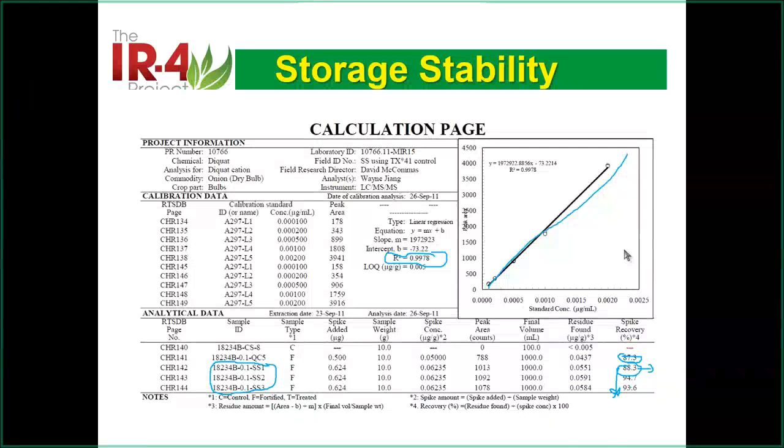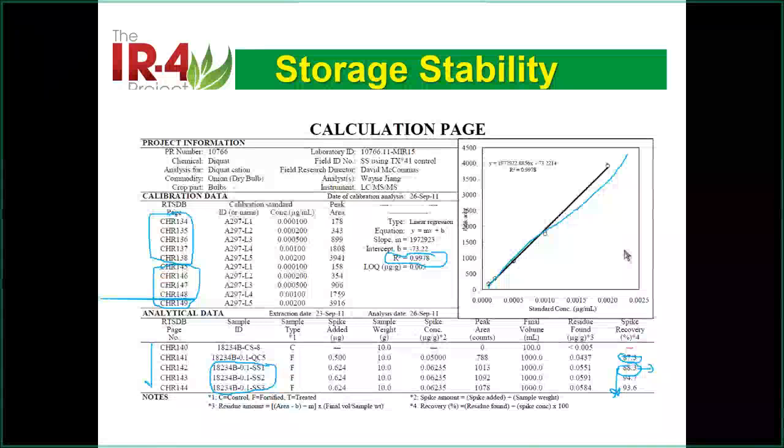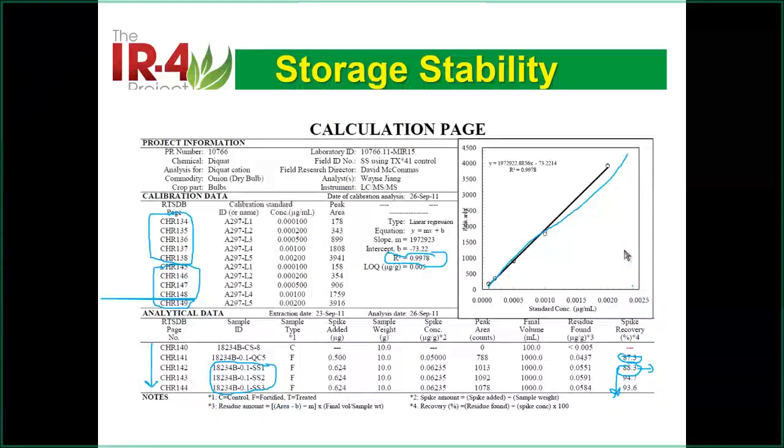You have two results, and within 15%. And the same thing, we have the first set of calibration, but it's exactly the same idea. And the second run calibration. Then the sample in between. So that's exactly the same requirement we have.